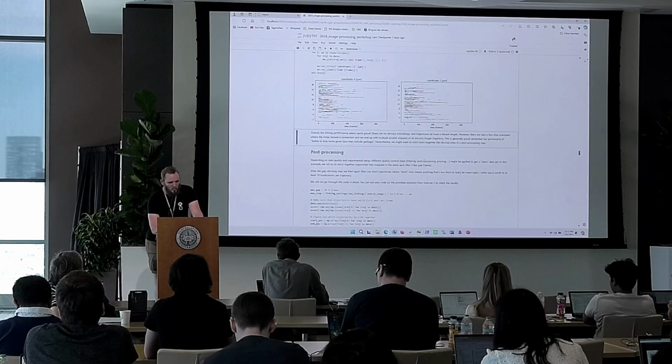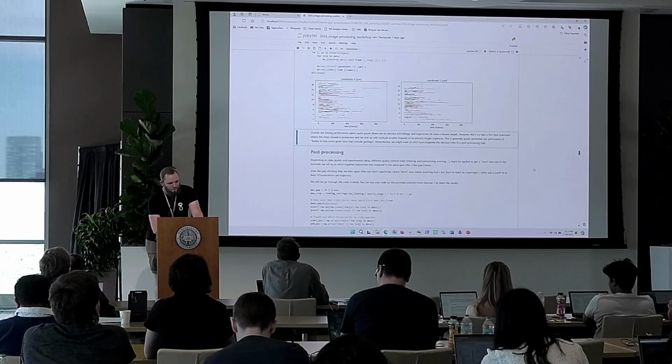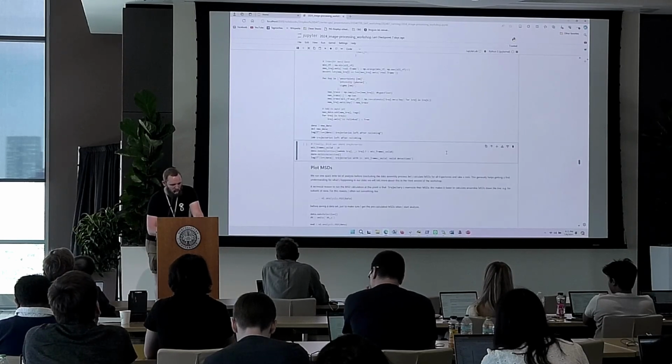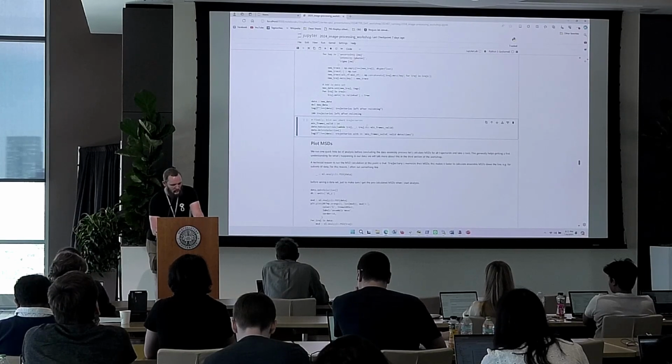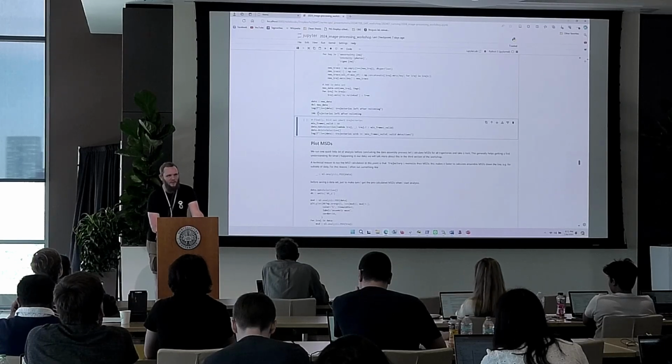As an example of a post-processing step, what I put in here is basically a step to relink across these larger gaps. We can basically just execute that for the time being. If you're interested, I can walk individual people through what's happening here in a bit more detail. The deal is that after we do this relinking step, we now only have 180 trajectories. So apparently there were a few relatively short ones that now got linked together into longer ones.